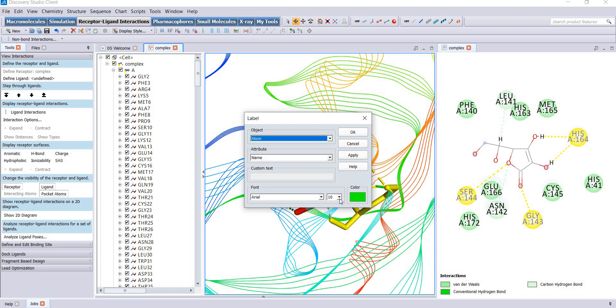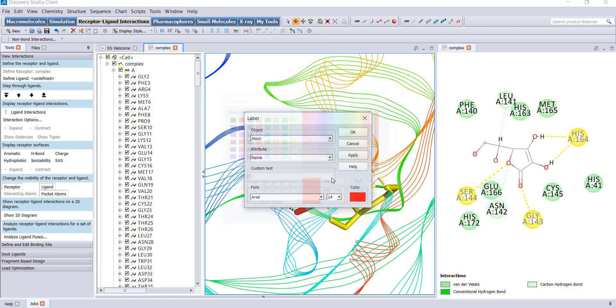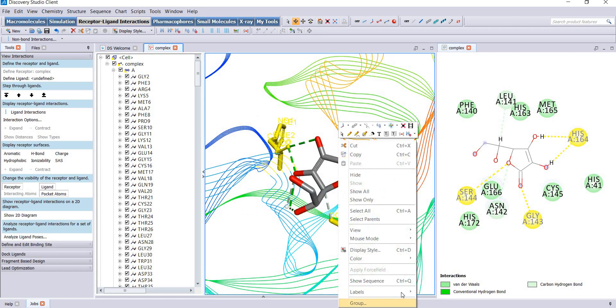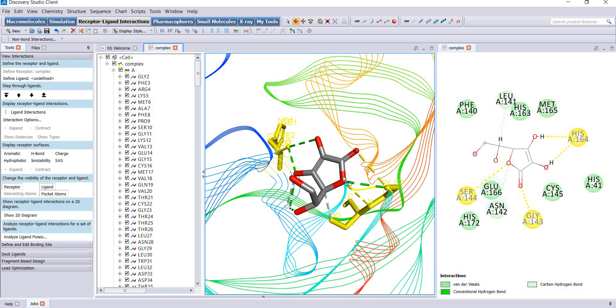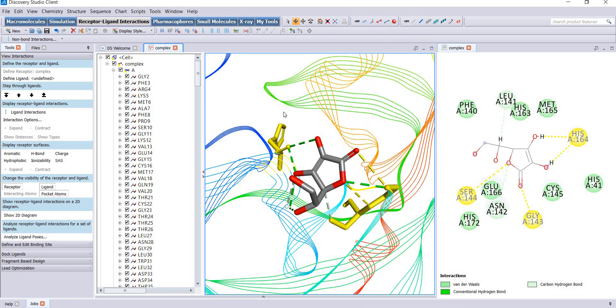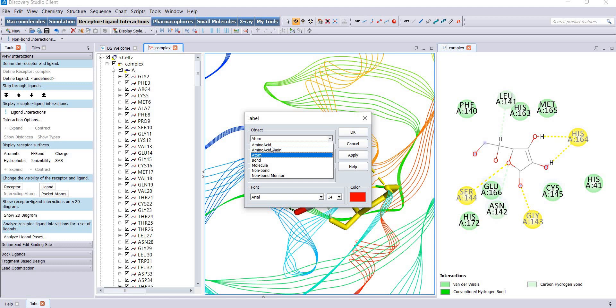I will change the size and color to red and apply. You need to go to labels, add, and make sure that you change it to amino acid.